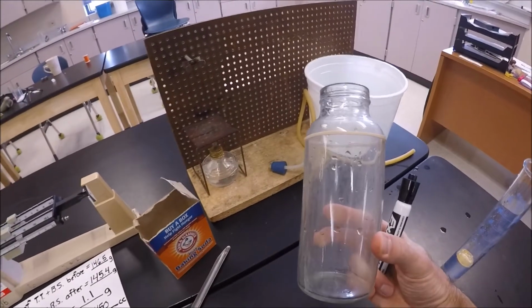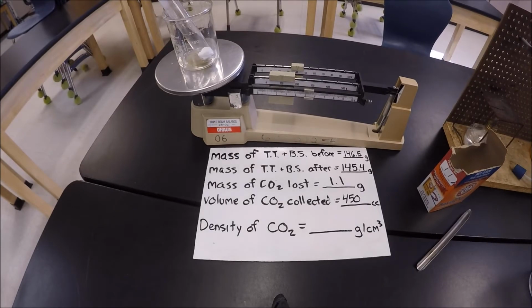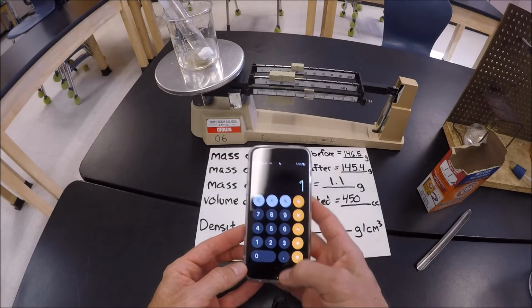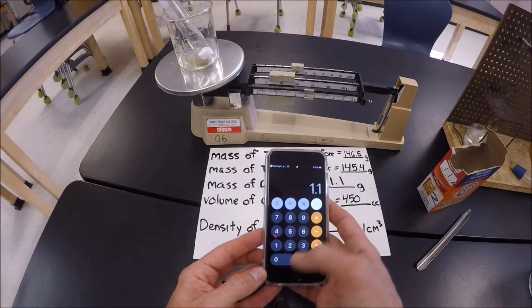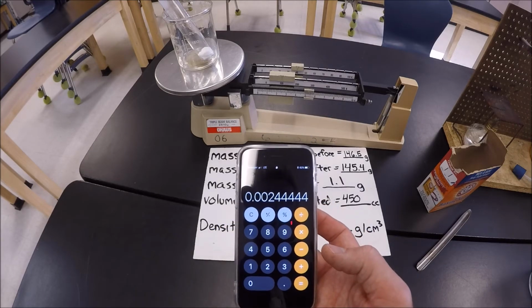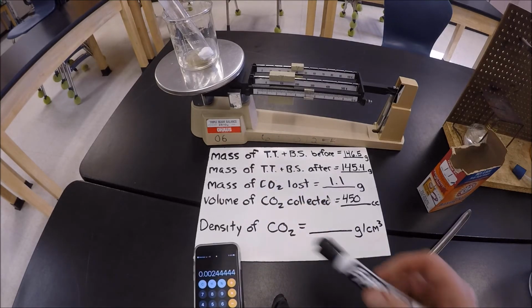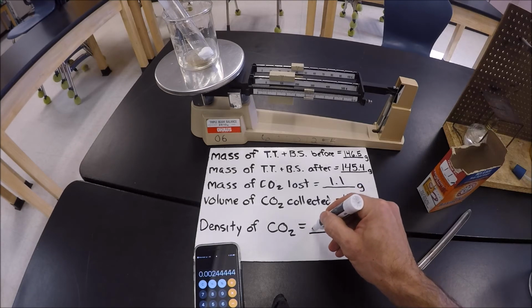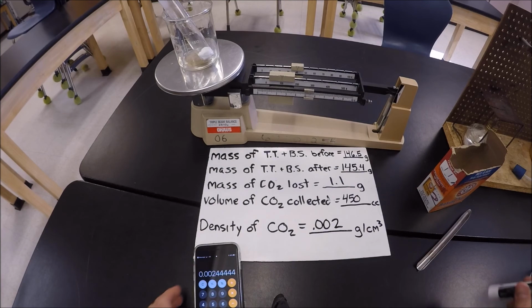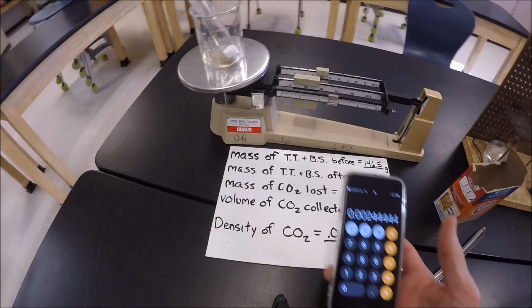So that's how much we collected in this jar. And so essentially, at this point, we just need to take 1.1 divided by 450 on our handy-dandy calculator. 1.1 divided by 450 equals 0.002. The density of the carbon dioxide is 0.002 grams per cubic centimeter. Look it up. We got really close. That's great.